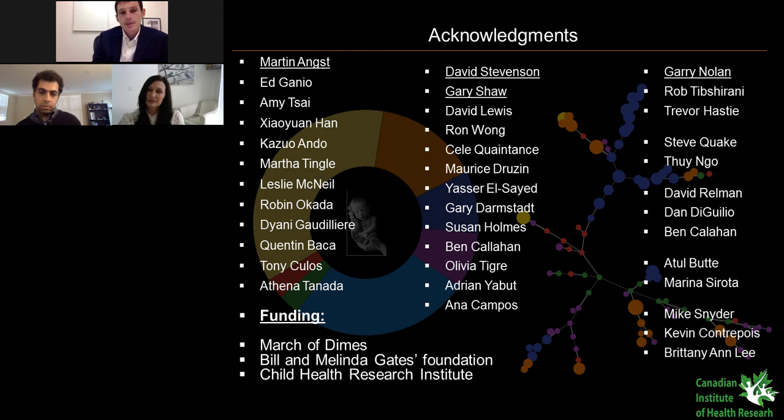That's a limitation. However, there are, in our hands, very important advantages. So number one, you have access to the entire immune system. Neutrophils in particular and all their subsets are accessible with whole blood assay, and you lose them with PBMC.